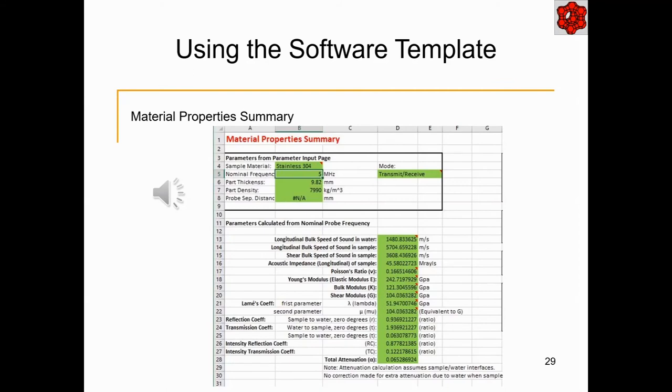There is a summary of the material properties provided on a separate worksheet. When both longitudinal and shear velocities can be determined, a full set of calculations is used to generate the table. Note that the temperature and density that were entered on the test description worksheet are used to calculate many of the values, so ensure they are correct. Temperature in degrees Celsius and density in kilograms per meter cubed.